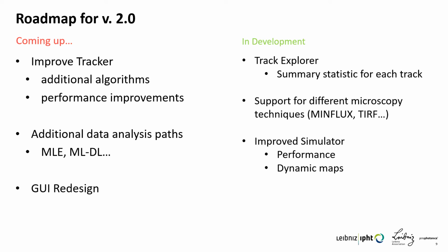And also we would like to improve the tracker by adding more tracking algorithms and improving the performance, of course. Additional data analysis paths, such as maximum likelihood estimation or some machine learning or deep learning powered paths, and some GUI redesigns, especially for the tracking and the simulation part.